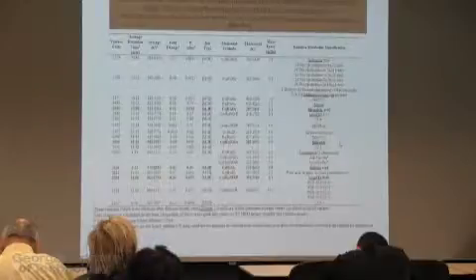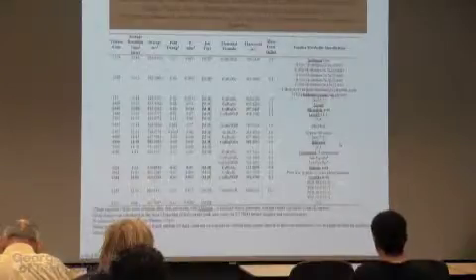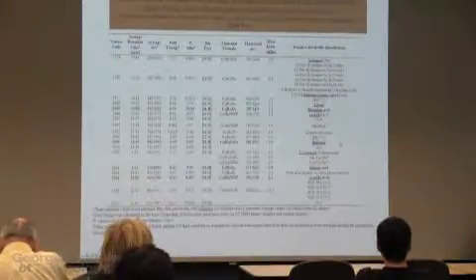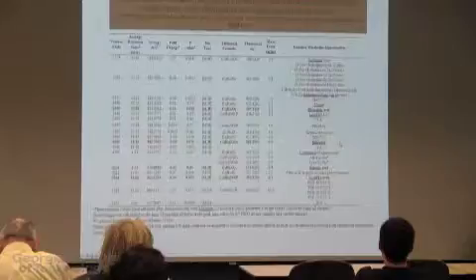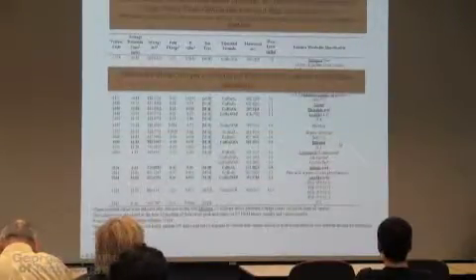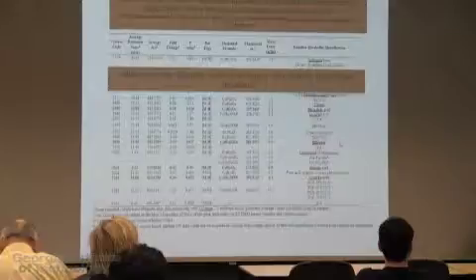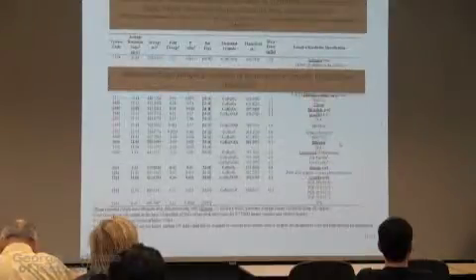So I show you this list of metabolites, and the question is, these are in blood. Are these coming from tissue, or is this related to the tumor? What is the connection with what's happening in the ovaries? The other thing that you can do in these experiments is look at the tissue itself, but you don't need to homogenize and extract the tissue. You can actually do mass spec directly on the tissue.